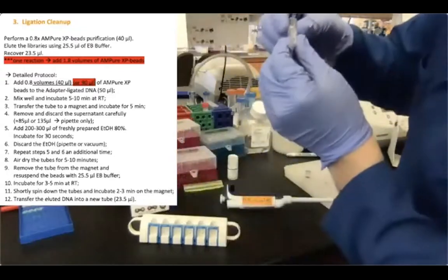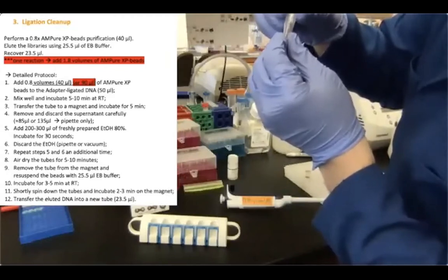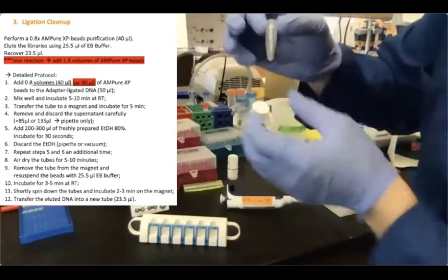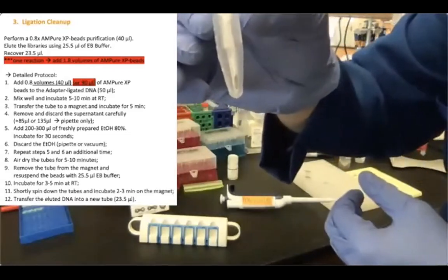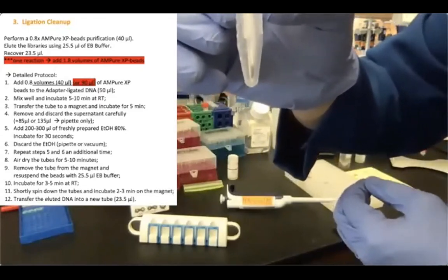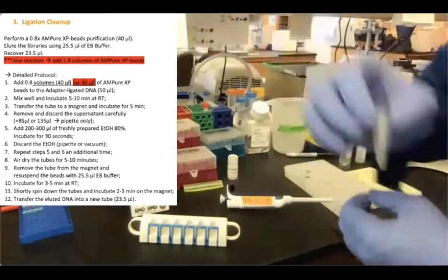Let's check the other one. So the other one is still not ready. I'm looking at the bead pellet, no cracks. Now it's not glossy anymore. Okay, so I can add my resuspension buffer. I think it's pretty difficult to see because the tube itself is kind of glossy, so it's pretty difficult for you to see that the bead pellet is not. Okay, but trust me.